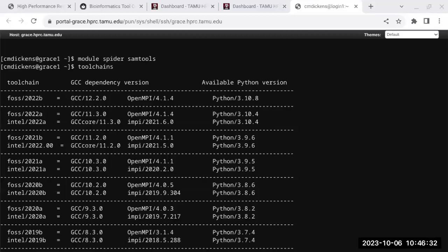And if you're going to load multiple software, it might be easier, if you see it says to load this software, use GCCcore 8.3.0, you can use this table and say, instead of just loading GCCcore 8.3.0, I want to see everything that's available all the way up to FOSS.